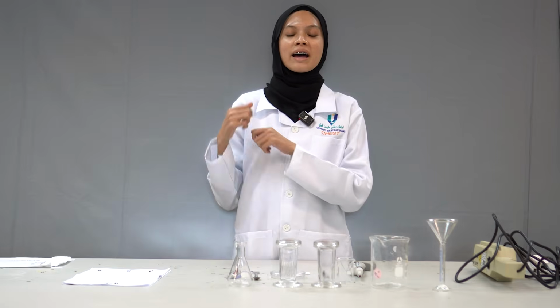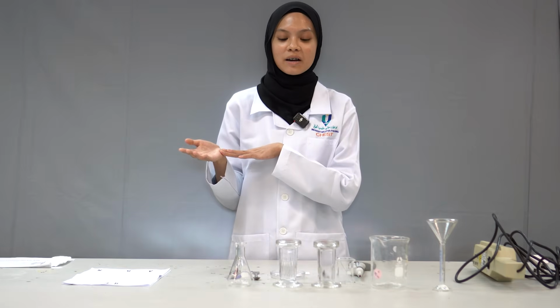Thin layer chromatography, known as TLC, is a solid-liquid separation partitioning technique used to determine the purity and also the preliminary compounds. It is based on the polarity of solvents.